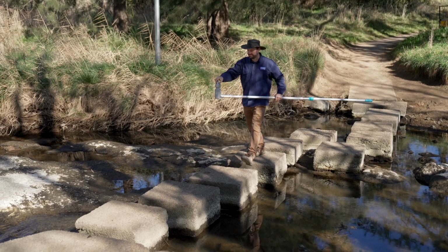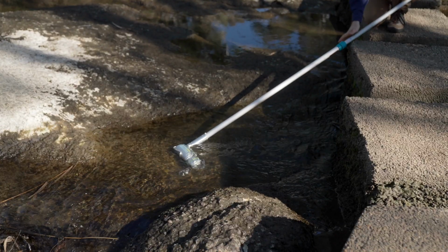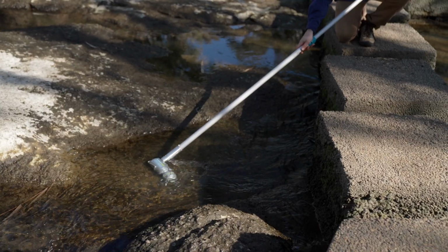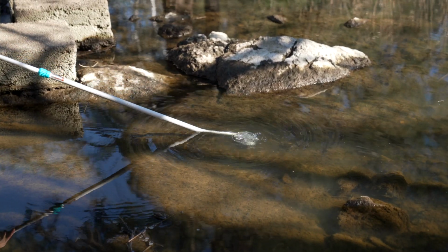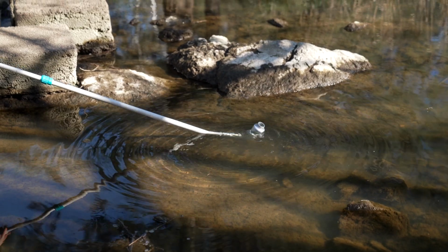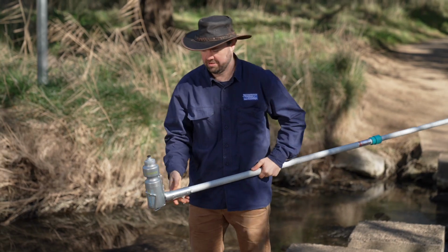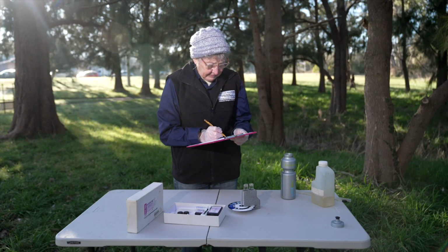To collect your water sample, attach your water bottle to the pole and dip it into the water. Fill and empty the bottle 3 times to remove any previous sampling water. Collect the water sample around 20 centimetres deep, avoiding the warmer water on the surface and the mud and silt at the bottom. Record your results on the provided data sheet. You will enter this data later into the Waterwatch database.